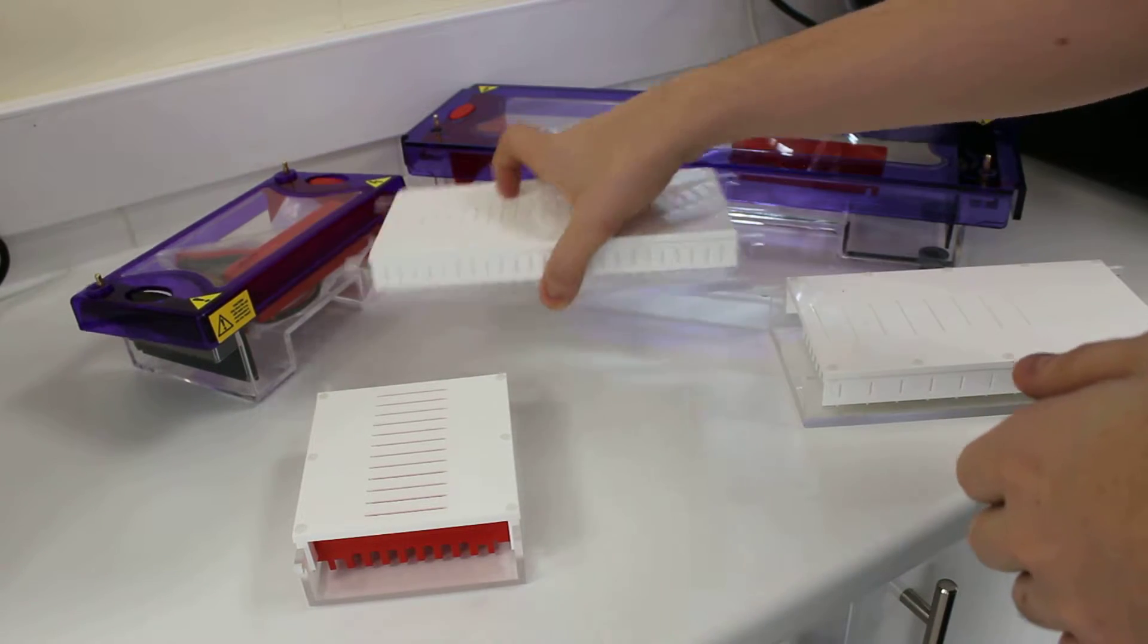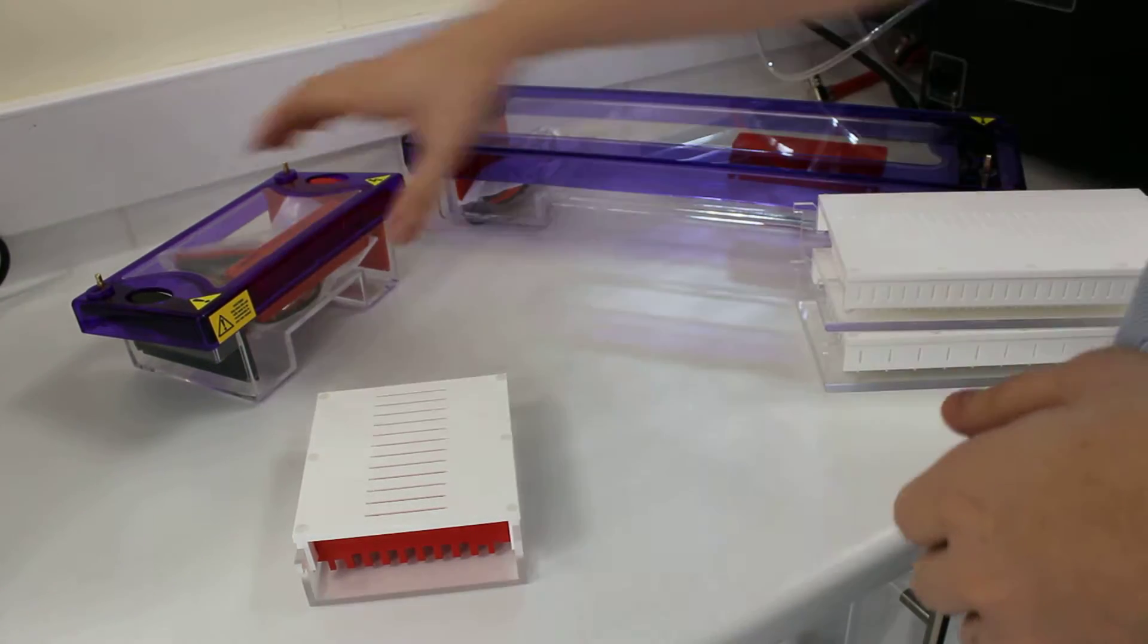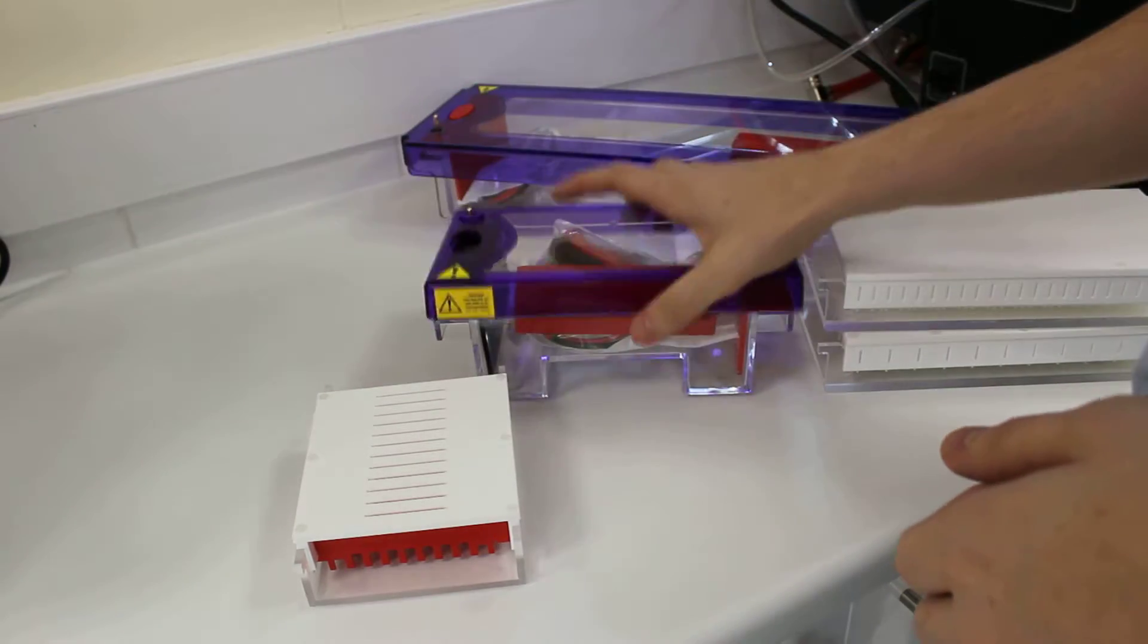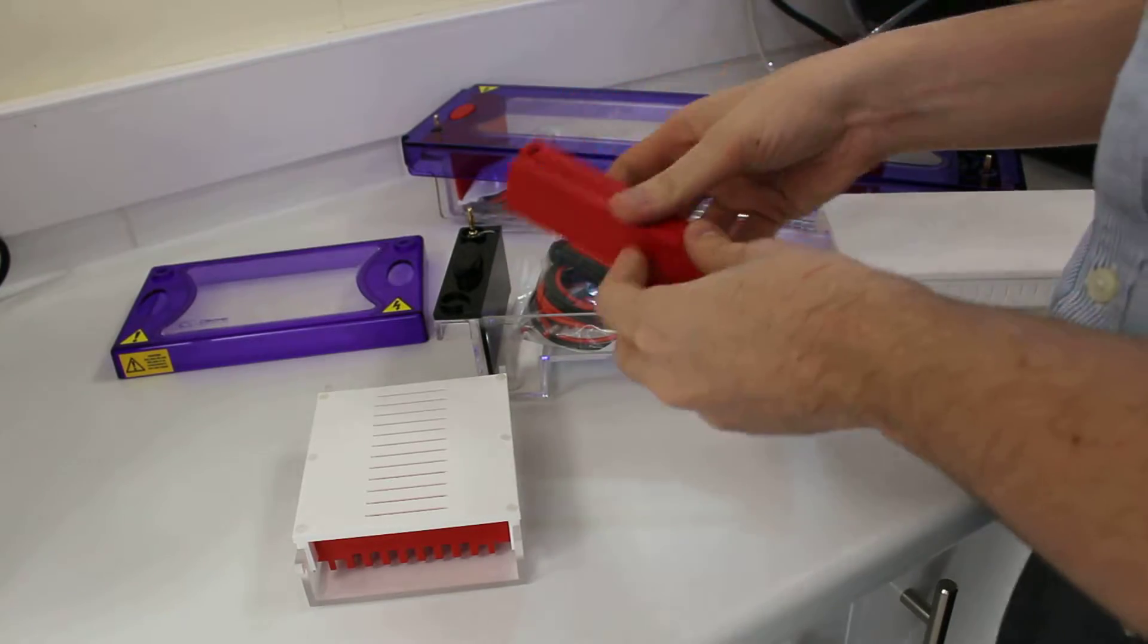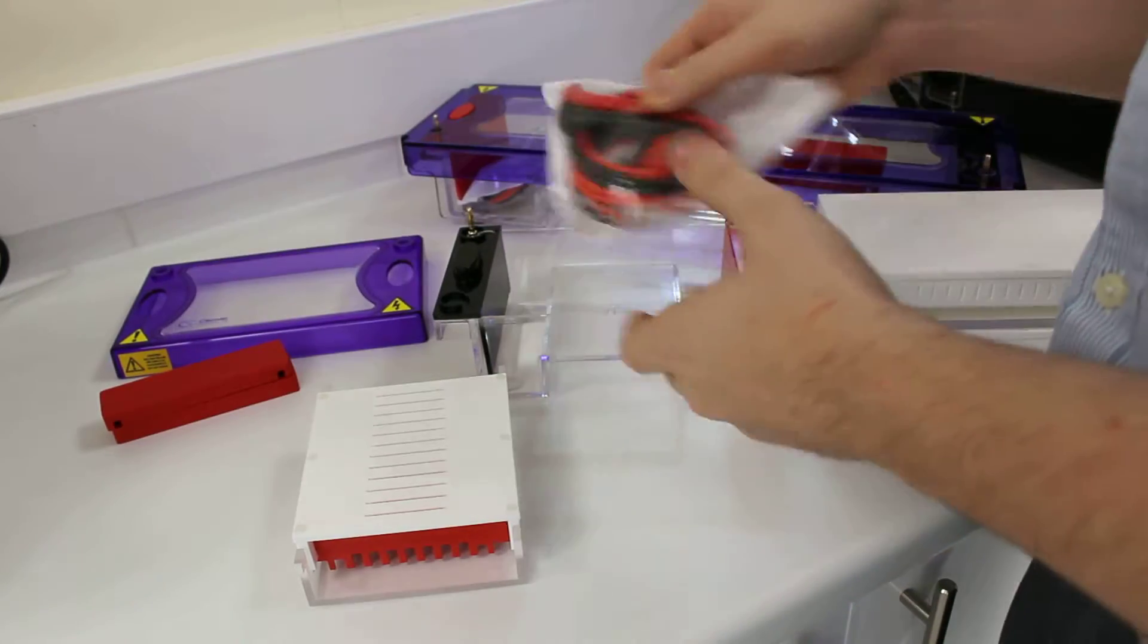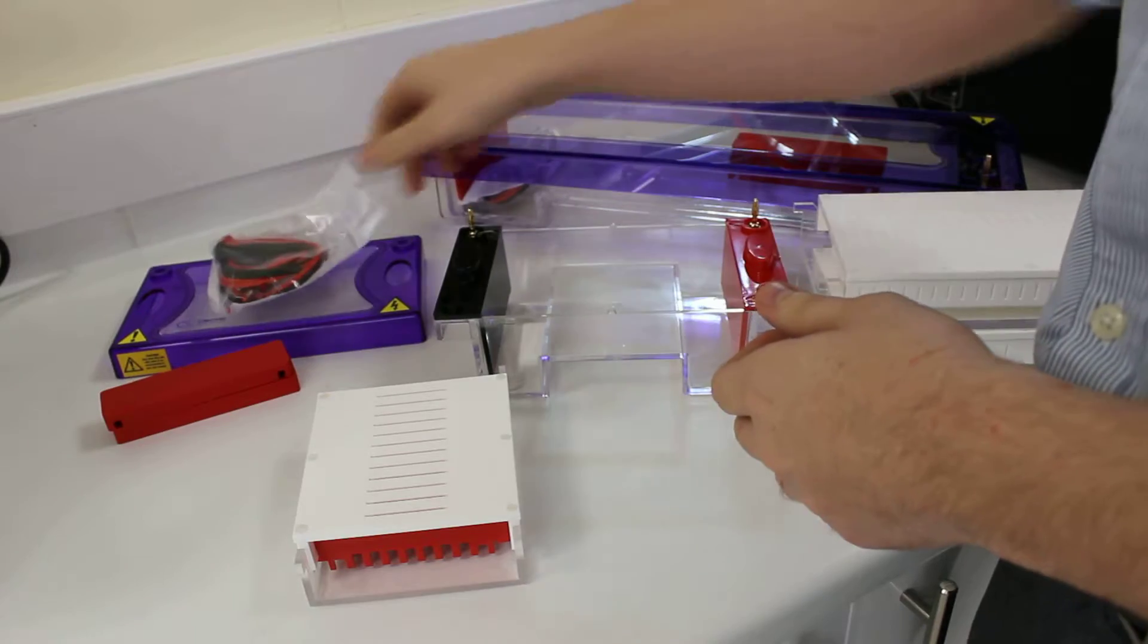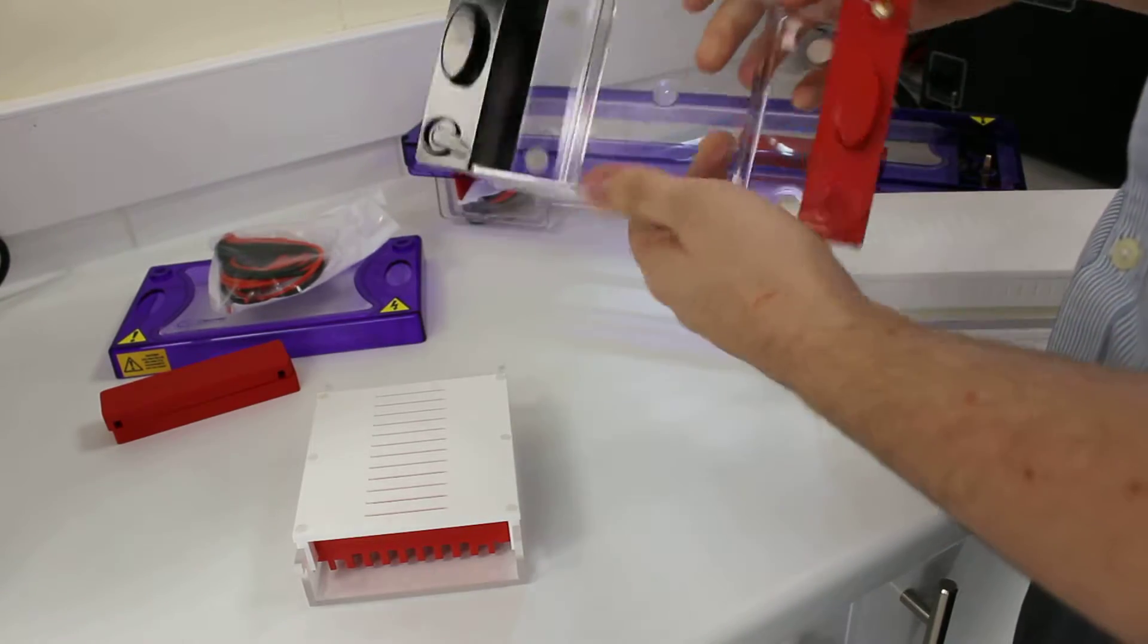The smaller one is the MS-MIDI-96. You get the MS-MIDI tank with the lid. These are the casting dams for casting the agarose gel. The electrodes connect to the lid and then the tank with the platinum wire electrodes at the bottom.